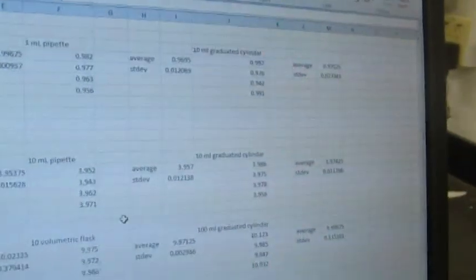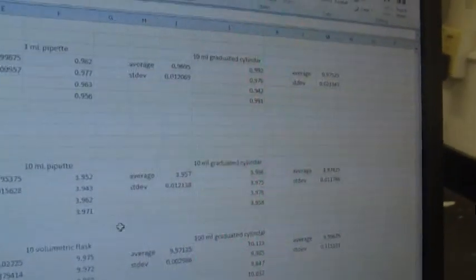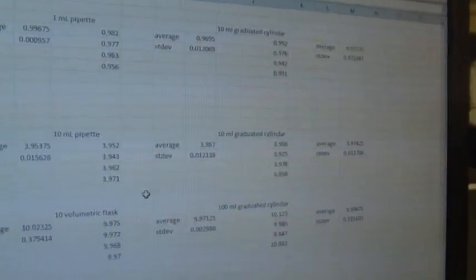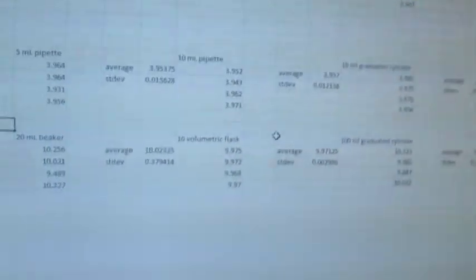Okay. So for today, because they're so close, we'll let you choose whether you want to go with the graduated cylinder or the milliliter pipette. You want to be consistent from now on, but it looks like in Jason's hands, he's good for both of them. I'll bet in a less experienced chemist, the 10 milliliter pipette would probably end up being more accurate, don't you think? Absolutely. All right, let's look at the 10 milliliter ones now.